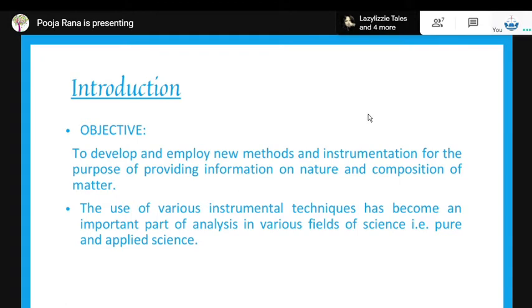Now, the chemical sciences serve as a proof of various advances and evolution of technologies, which has led to the growth of high performance instruments. So we often come across chemical instruments which are used for toxicological and chemical analysis of substances.